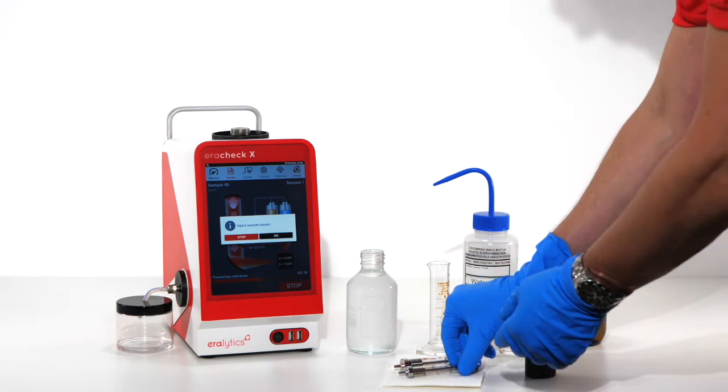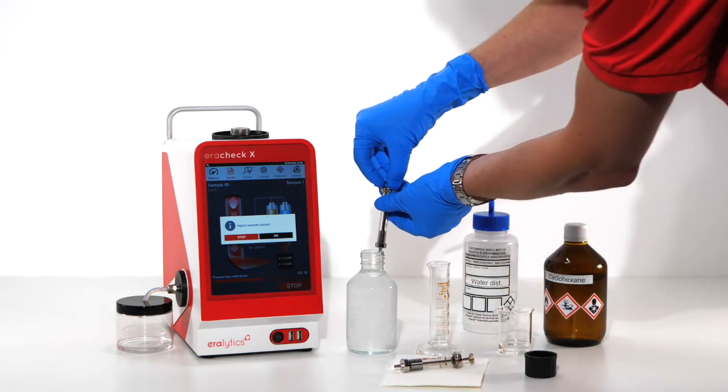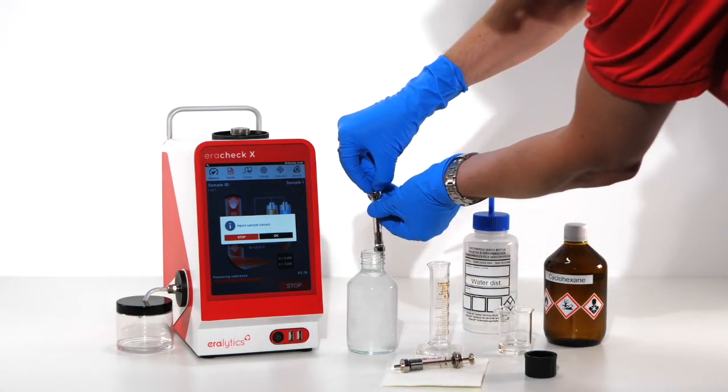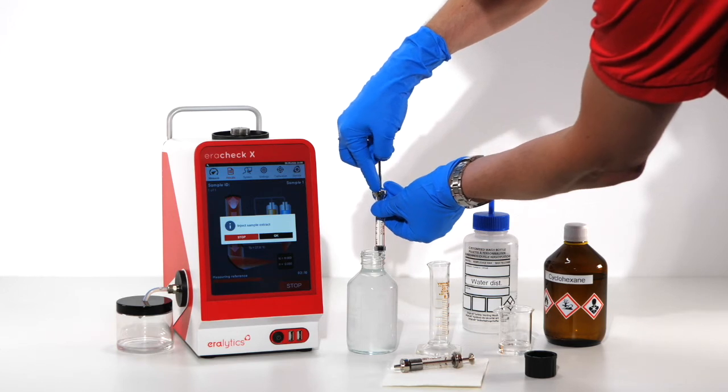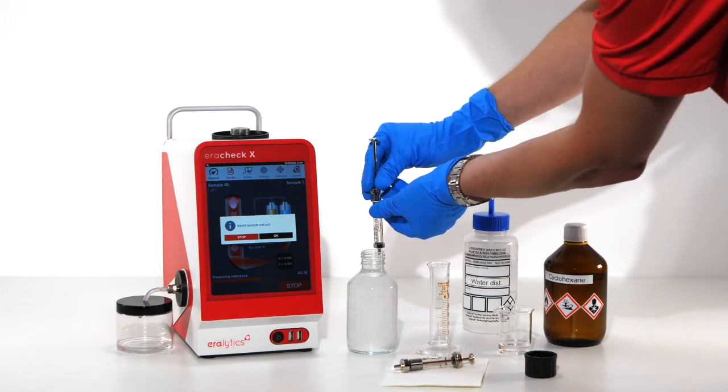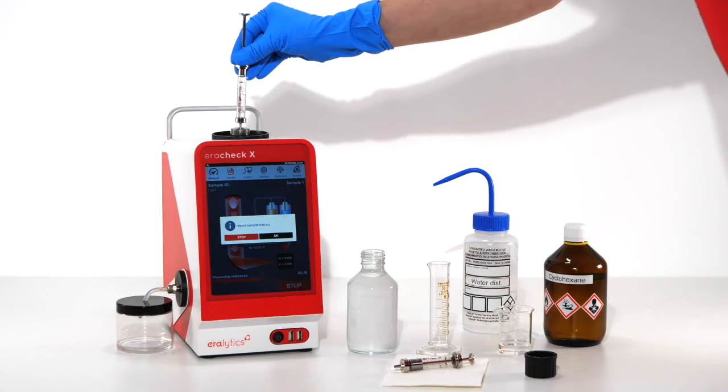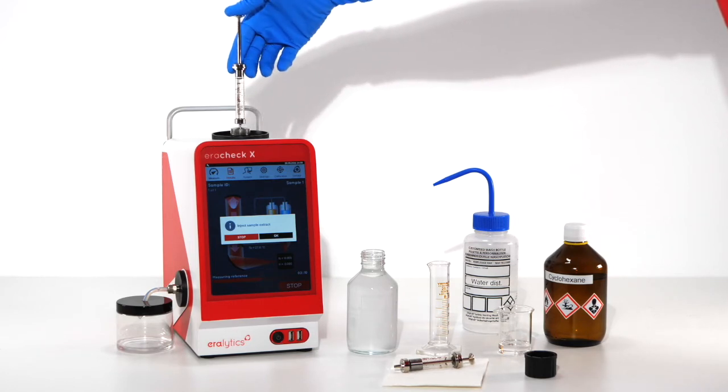Extract 3 ml. Then attach the syringe to the inlet assembly on the top of the analyzer. Slowly inject the sample and press OK on the screen.